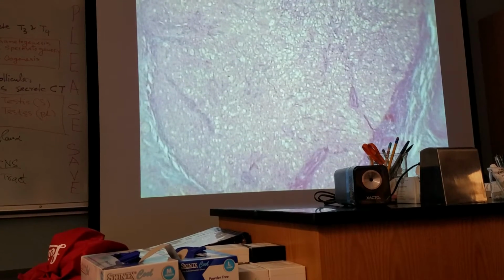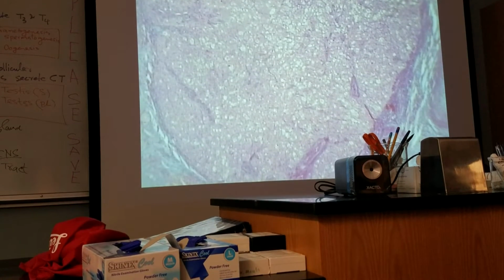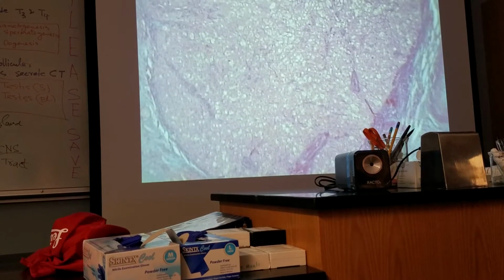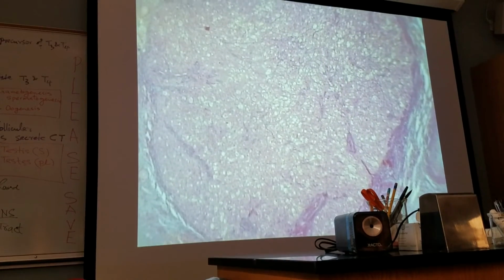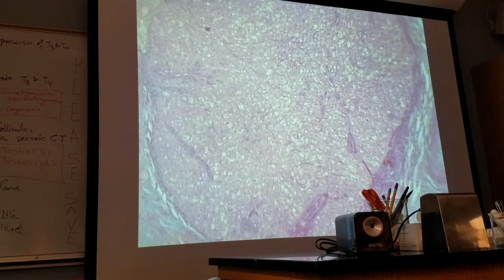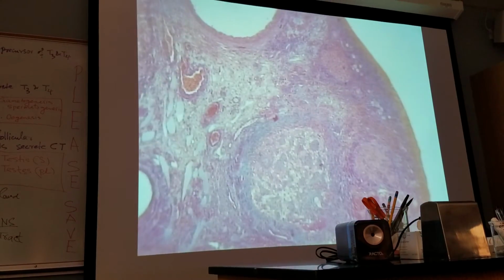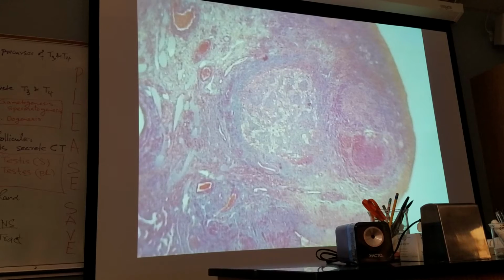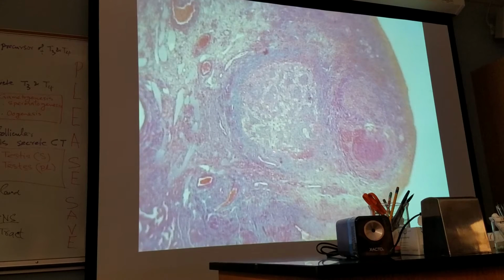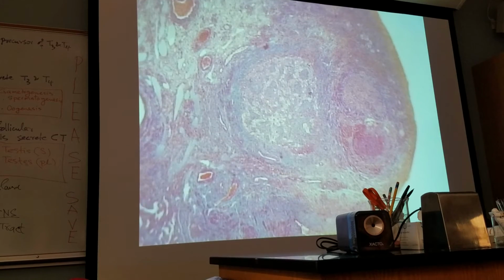After pregnancy, when this cycle is over, when all the kittens were born, what will happen? Will they still form or produce hormones? No, they will degenerate. So you have to look at a degenerating corpus luteum. This is a degenerating corpus luteum. Look, it has shrunk in size. It has stopped producing hormones.